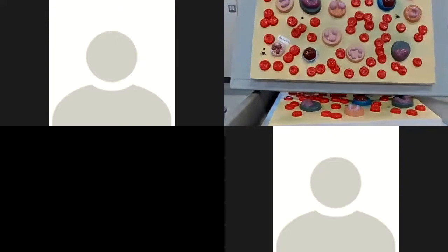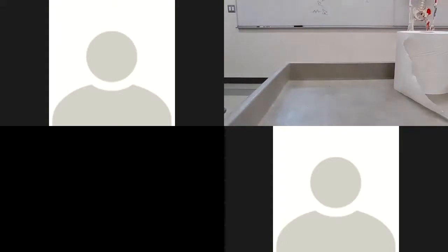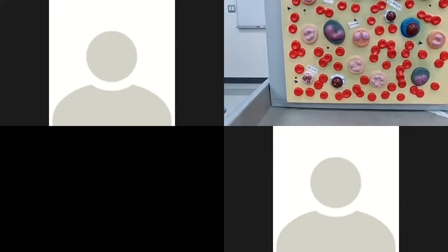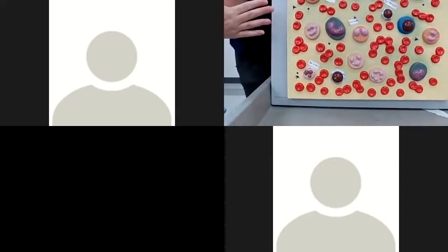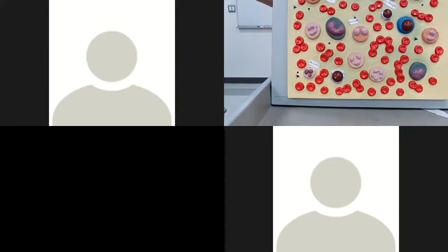Okay, so the blood board. Again, you don't necessarily have slides. The blood board is one way I can put stickies on and ask you things as well as pictures. If I was to take a droplet of blood and put it on a glass slide and put a top on it, this is what you would see. You wouldn't see this exactly, but similar to this.